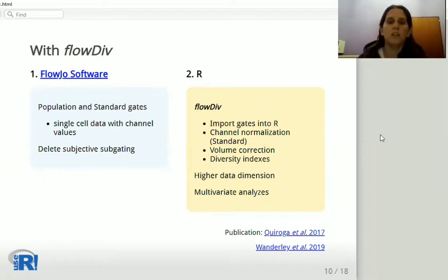FlowDiv directly imports the gates into R containing single cell data with multiple channel values. FlowDiv implements channel normalization and volume correction before calculating diversity indexes.